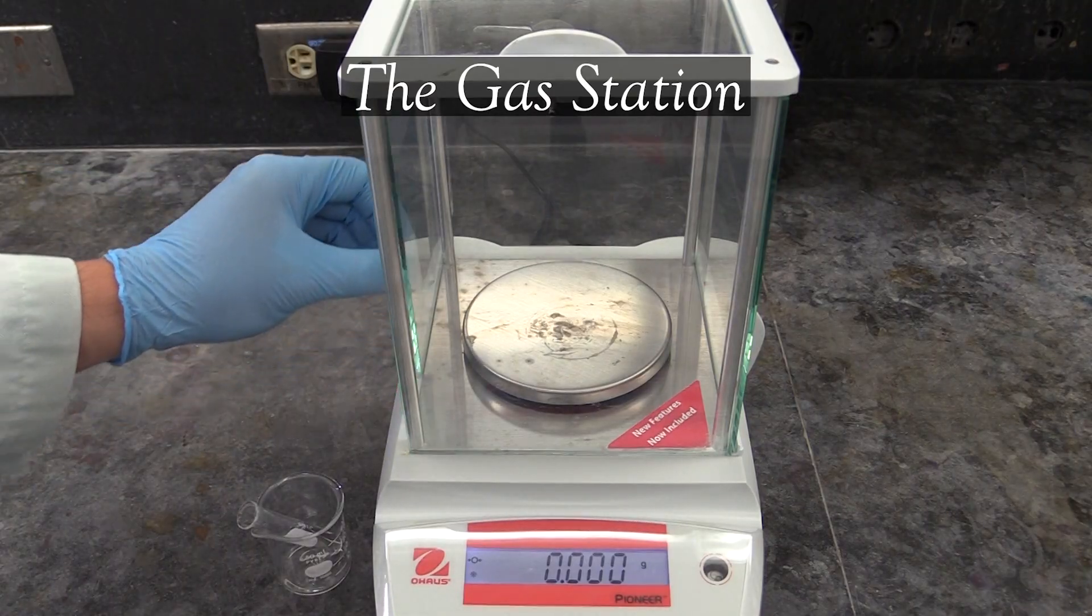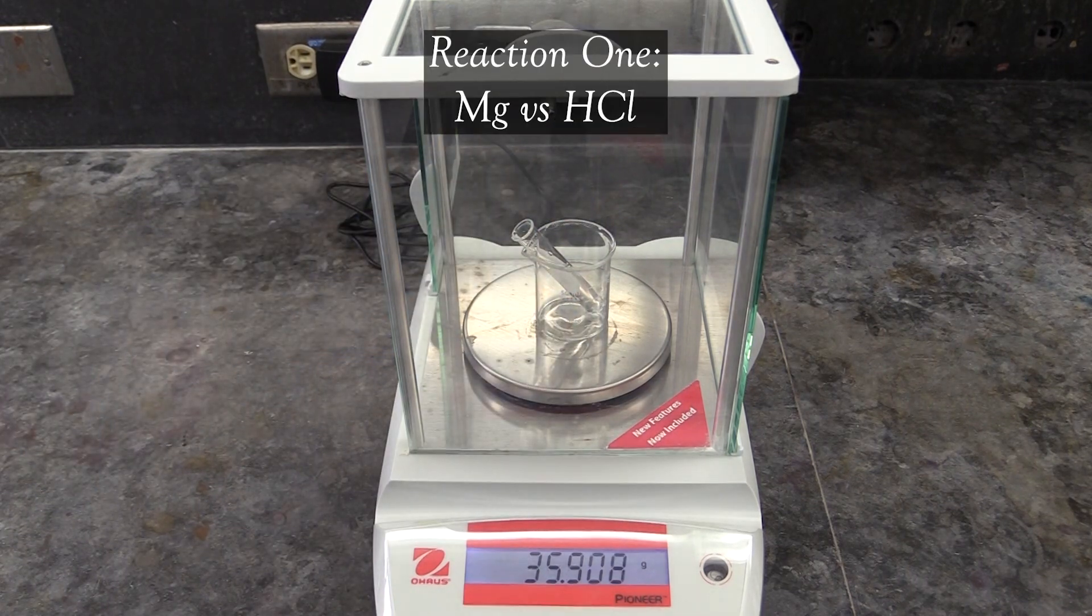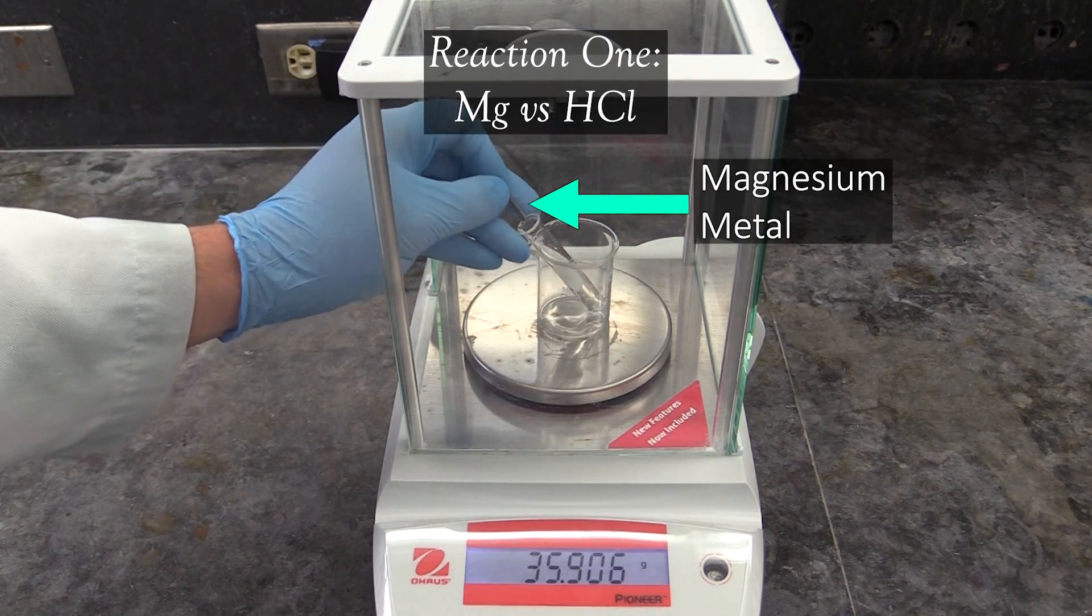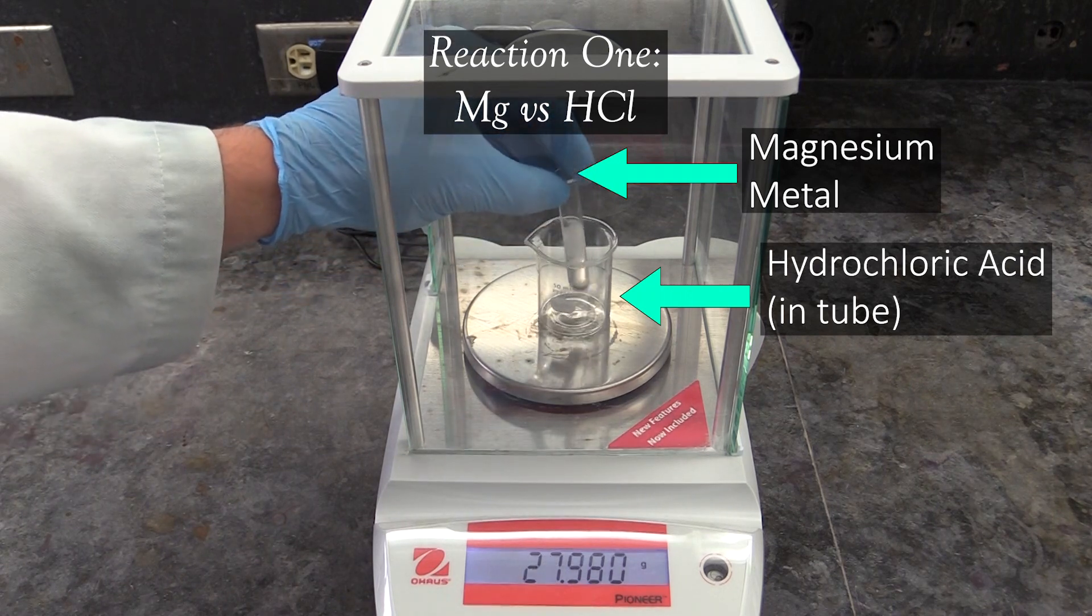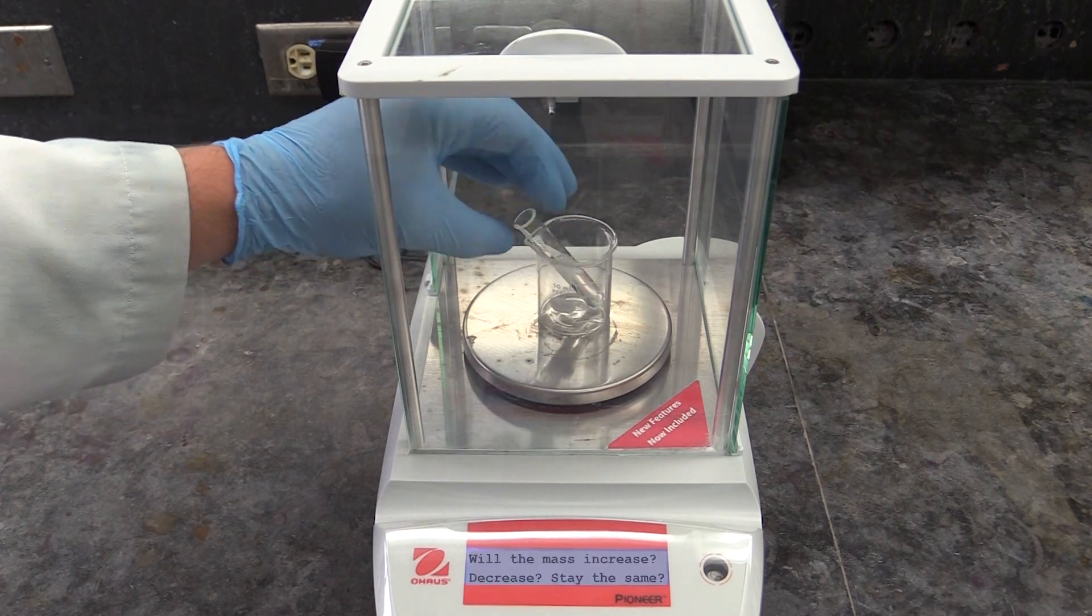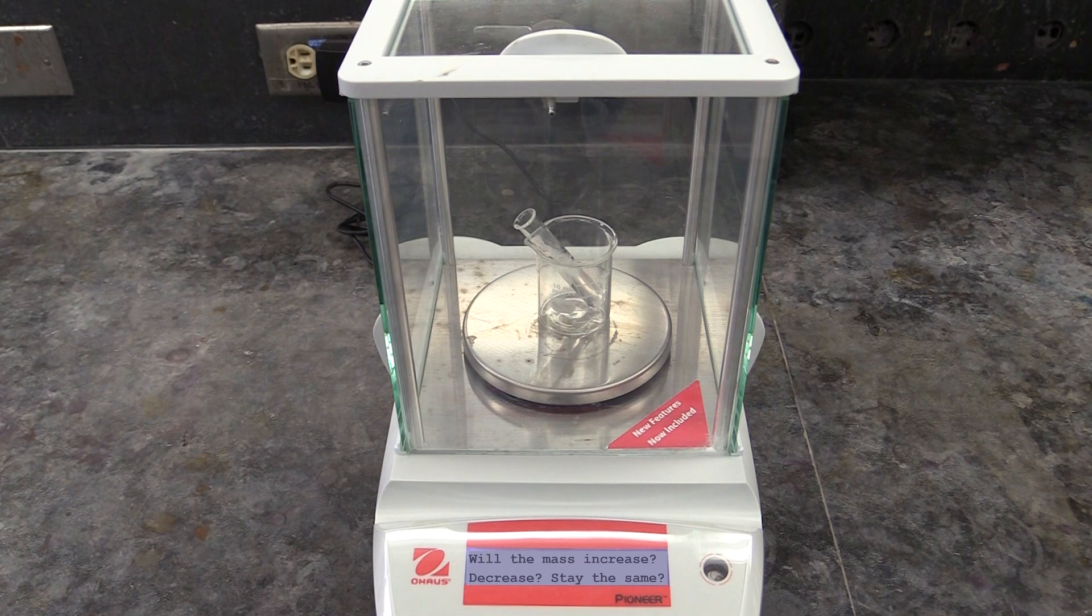And at last, we come to the fifth part of your experiment, which involves two gas-forming reactions. For the first reaction, you will react magnesium metal with hydrochloric acid. You'll do this on a balance so you can monitor the reactant's masses as it proceeds. Of course, for this to work, you are going to need your reagent's masses before you initiate the reaction. Keep that in mind when you go to collect your data.